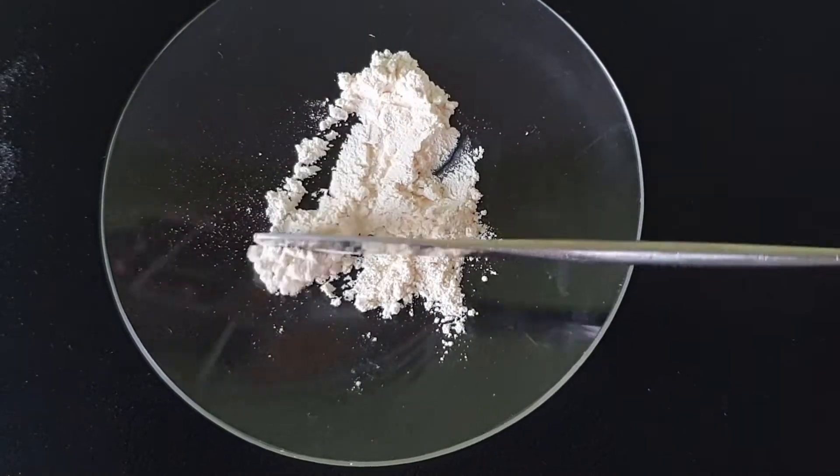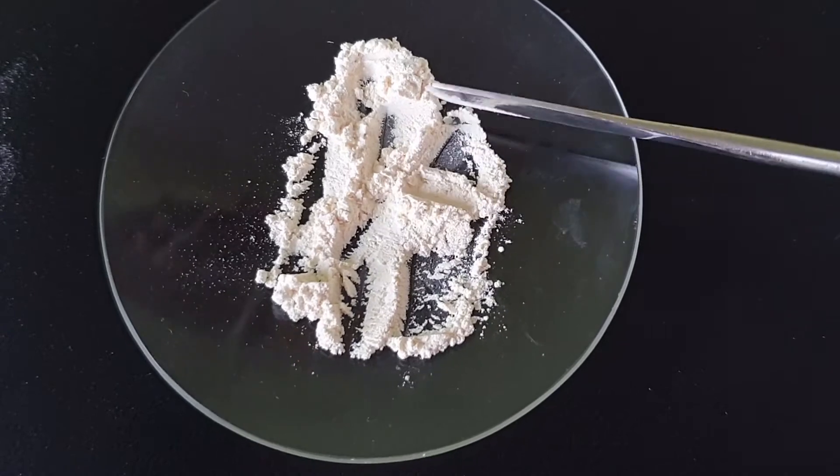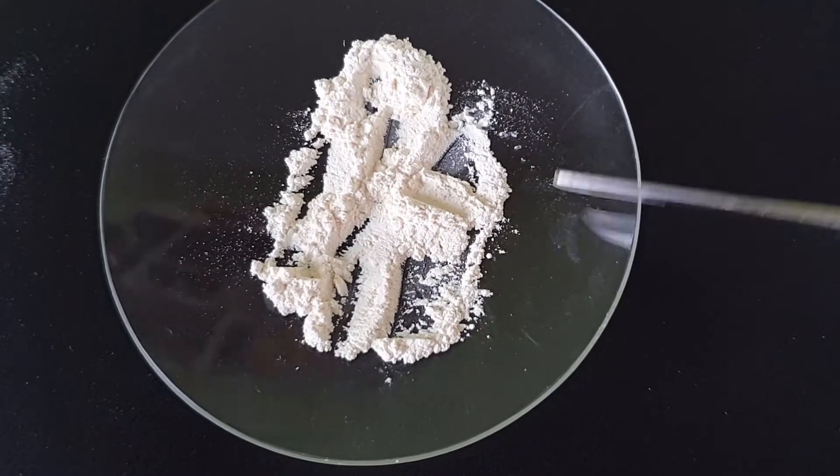But you can convert it into really nice cerium sulphate, which is much better suited for further chemistry, and this is what this video is going to be all about.